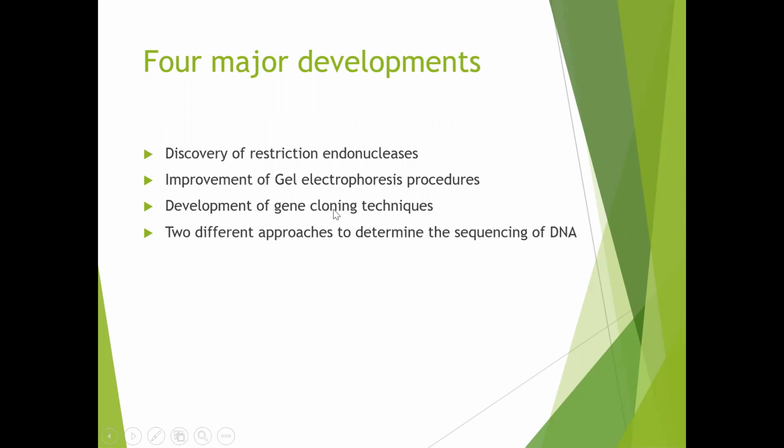And the third development is the gene cloning technique. With the development of gene cloning techniques, we are now in a position to produce, isolate and purify sufficient amounts of DNA required for analysis and characterization. So the third development is the gene cloning technique, by which we are able to sequence DNA these days.